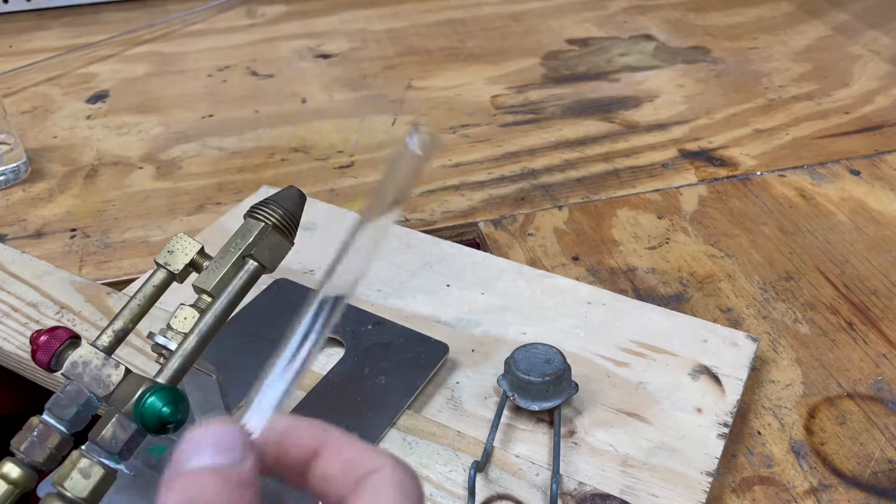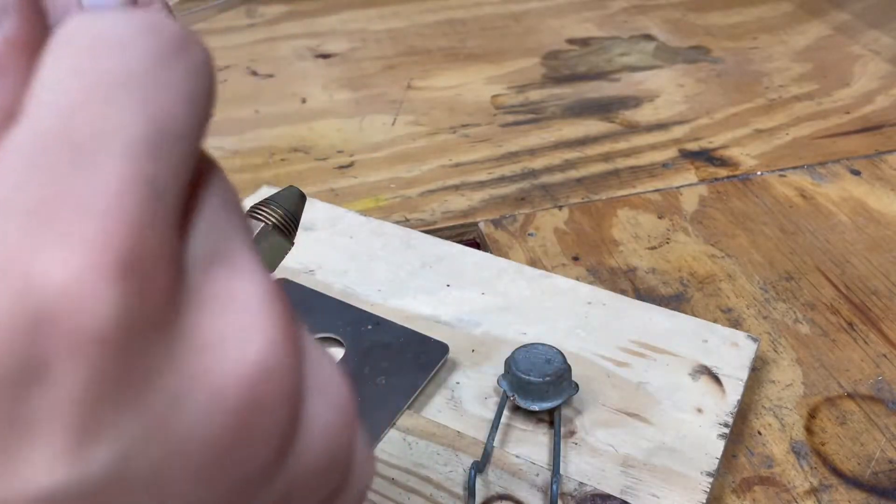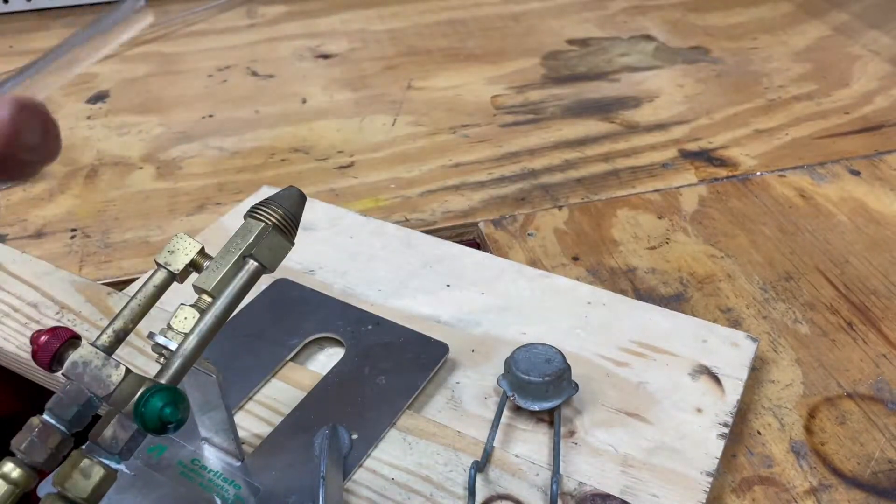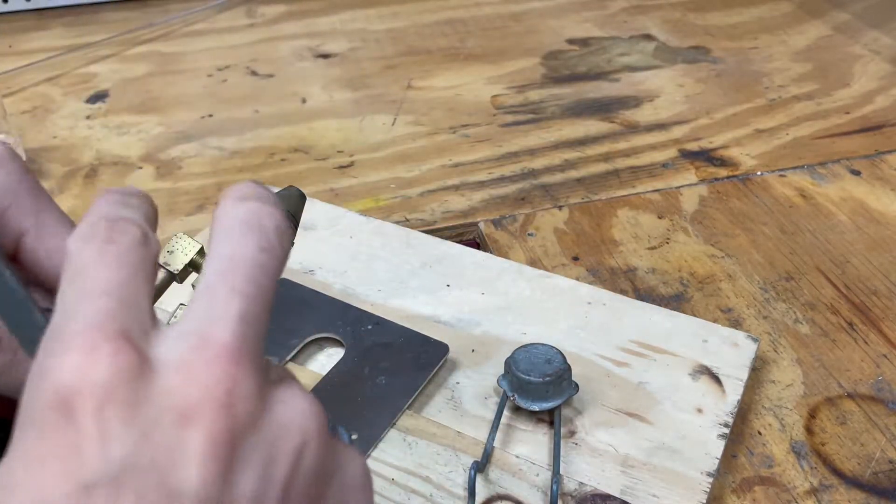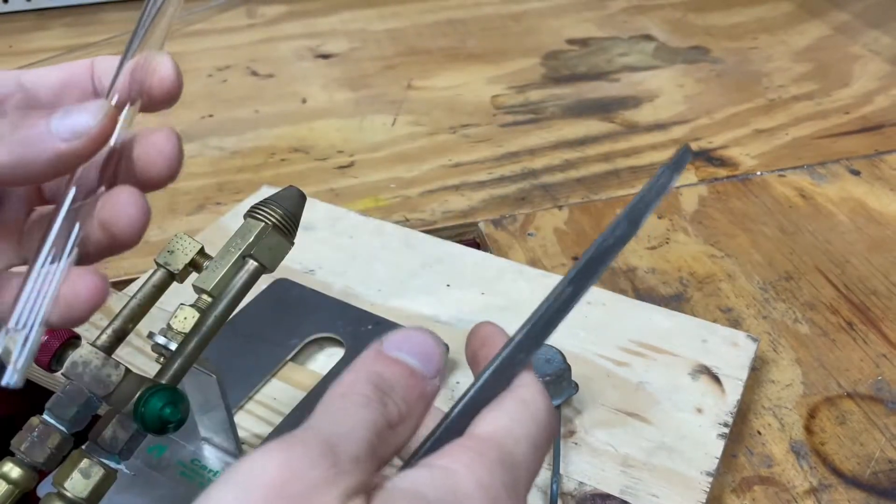This is more experienced and takes a bit more effort. You can use a file or you can use a tungsten knife, make a basic score and then break it the way that you did previously.